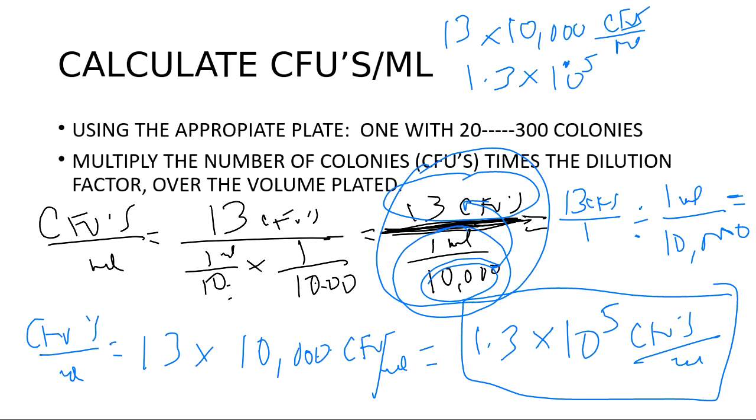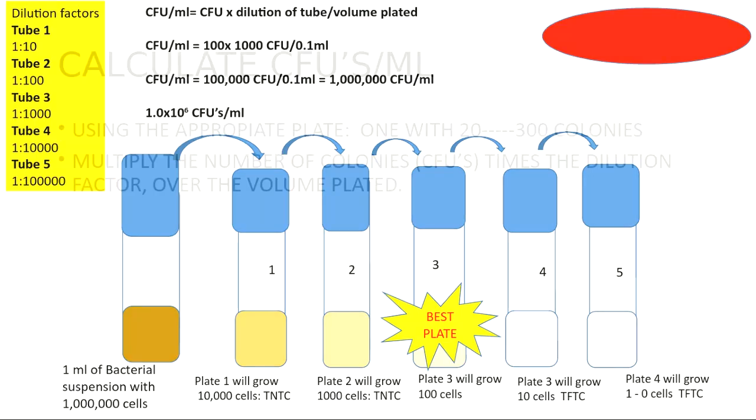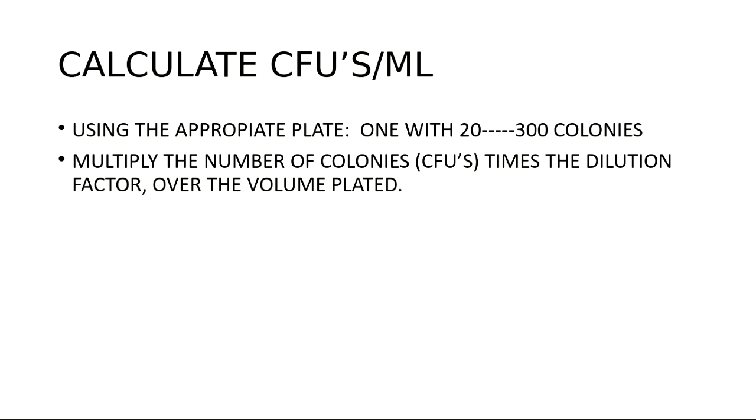Okay, CFUs per mil, units. Okay, so you should definitely be able to make these kinds of calculations. All right, so there's the example that we talked about.